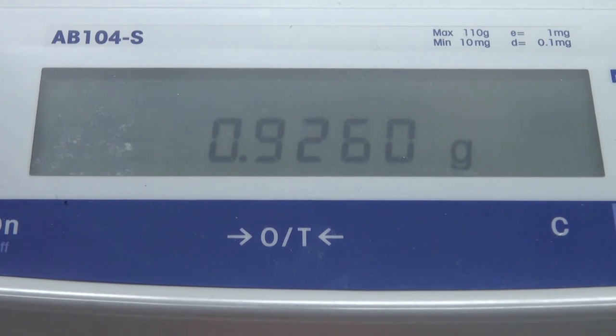We assume an uncertainty of plus or minus 0.0001 grams in this measurement.